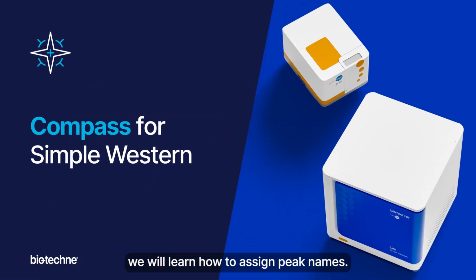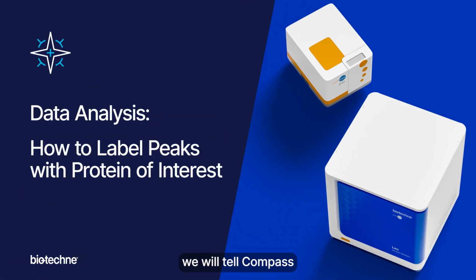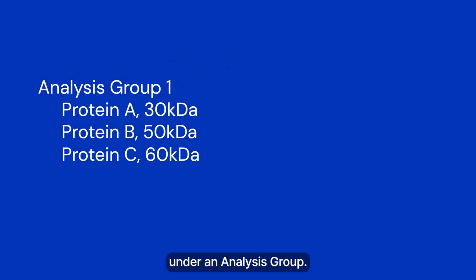In this video, we will learn how to assign peak names. In other words, we will tell Compass what size our proteins of interest are so it can match a peak to a protein. Peak names are saved under an analysis group.